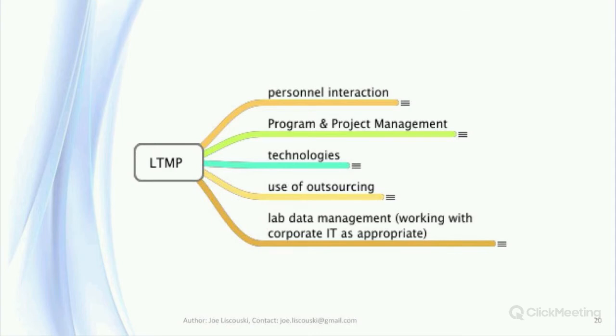The purpose of these professionals is to bridge the gap in subject matter expertise between lab and IT personnel. From an IT perspective, it could be viewed as a specialization within their organization. From the lab side, it would represent a source of expertise that would help them plan and implement systems they need in their work.